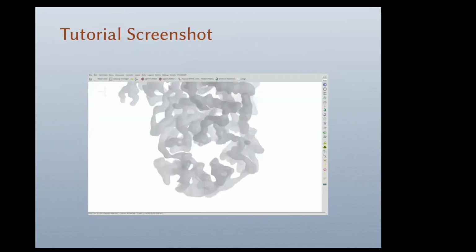Right. So the Coot tutorial has been updated. Well, I continually tinker with it, but this is its current state. So we have a structure that was from the lab of Laurie Passmore, my colleagues, from a year or two ago now.